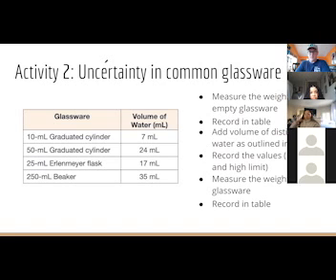Do you understand what we're trying to do with that? Yes, I understand. Basically, there are internal divisions in the two cylinders, and there really aren't for the flask. There is an internal division, but it's really big, and for the beaker, there's no internal divisions at all. So our interval uncertainty for the volume is going to start small and then get huge.